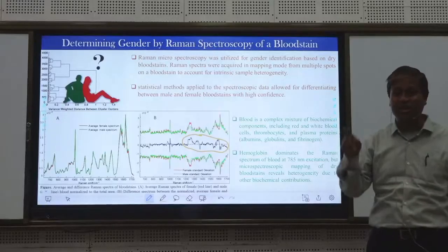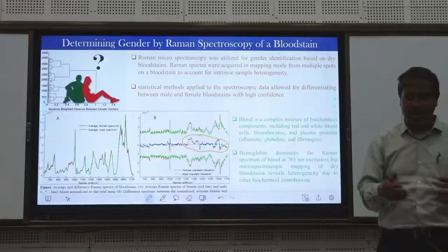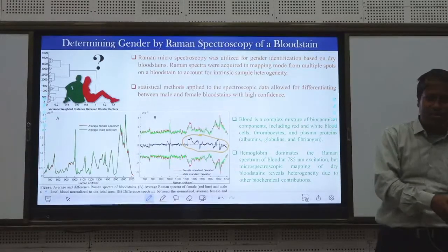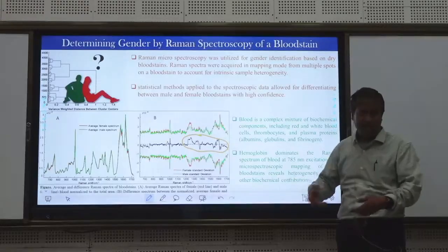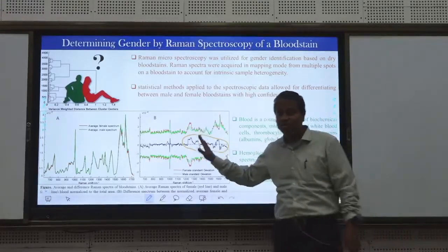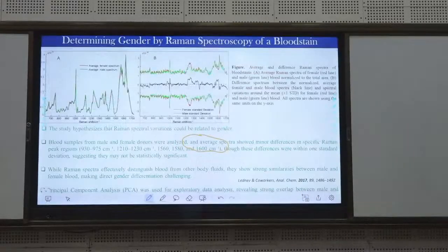Based on your study, you can tell that this is this, and you can convey it. That is scientific evidence. And when you present scientific evidence to the court, obviously the court has to accept. But does the scientific community accept your evidence? Researchers will be very critical that this kind of thing is not good enough for convicting somebody. So that's why these statistical analyses are done.